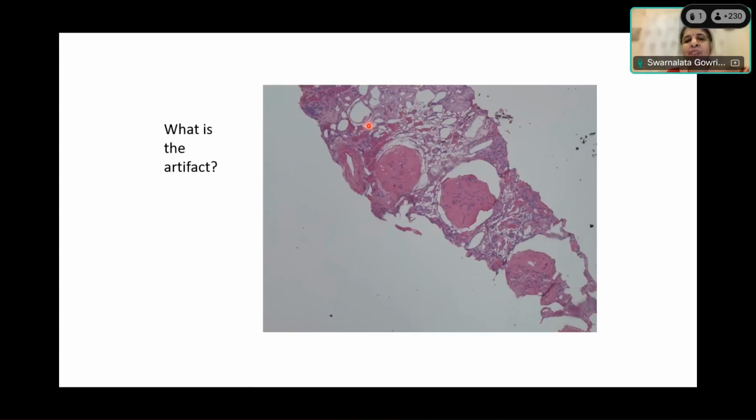The formalin froze, the tissue froze, and you have no idea, because by the time it reaches you, it's at room temperature, and it is in buffered formalin, everything, and you have processed it very well. So when you get artifacts like this, remember, it could be because your tissue has been inadvertently frozen by a very enthusiastic person. And these are actually all the ice crystal artifacts. The ice crystals get into the tissue, and then when the tissue thaws, those spaces get left behind. It's a very, very bad artifact, something which you cannot do anything about. You cannot retrieve the tissue.